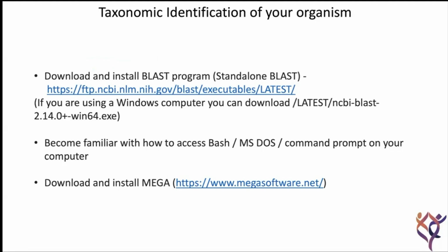A very important task, especially if you're new to genomic data and you want a good starting point, we highly recommend that you download BLAST. So this is a standalone program. You're probably very familiar with using BLAST as an online tool. And of course, that's very useful, but it can be extremely useful to be able to generate your own bespoke databases that you can then search against with sequences that you have in hand.